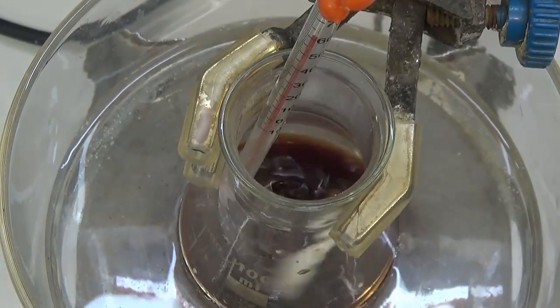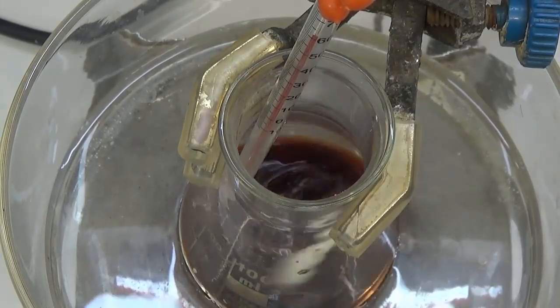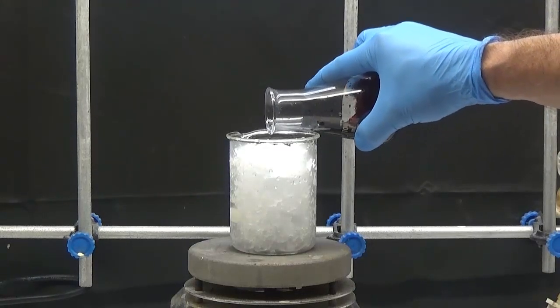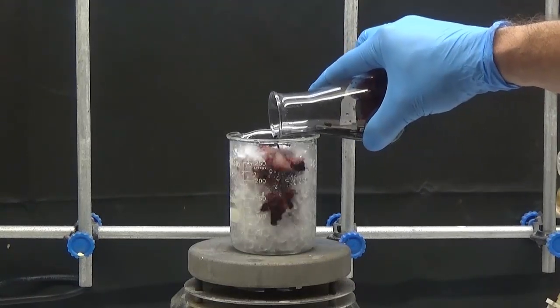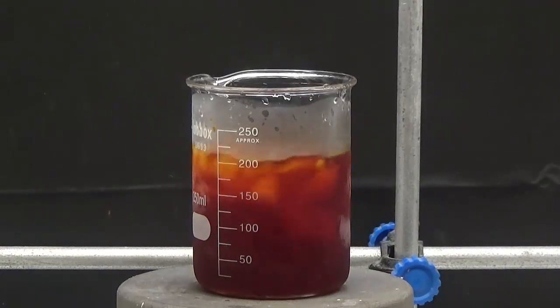Once all the isonitrosoacetanilide has been added, stir for 20 minutes and pour over 150 g of ice with heavy stirring. Wash the flask two times with a small amount of water. Stir for 30 minutes until an orange precipitate appears.